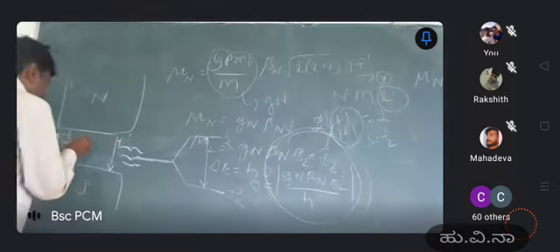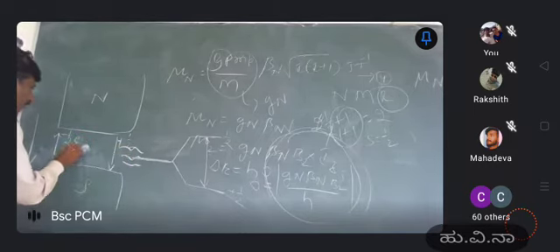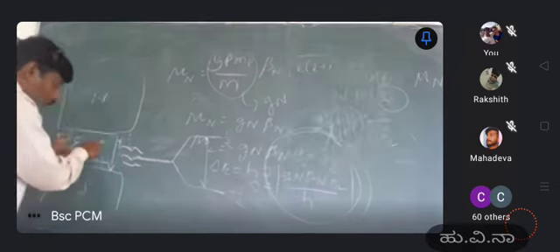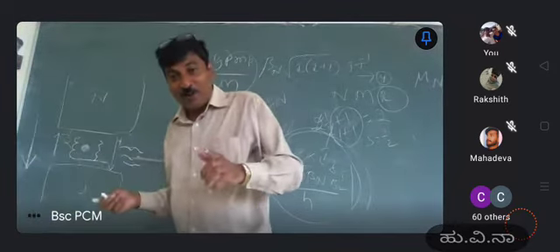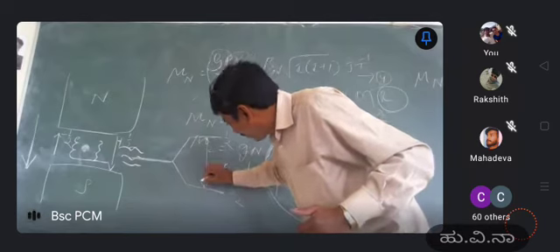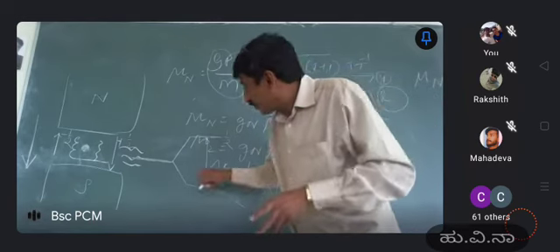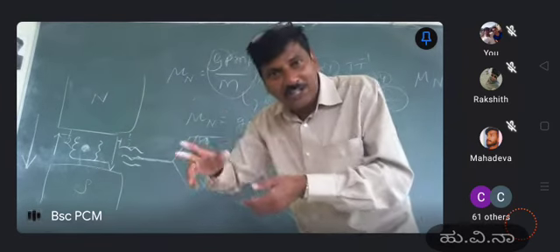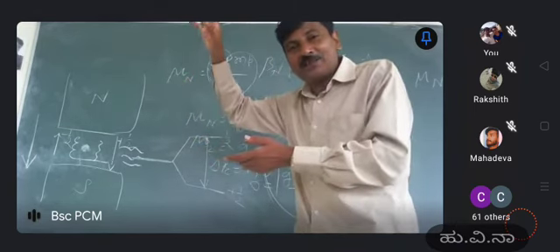Suppose I am producing these radio waves through a coil. When the nucleus jumps from this energy level to this energy level, there is a change in the magnetic flux. The coil is a conductor, so that automatically produces an EMF. That EMF goes from the detector to the recorder, and it is recorded.